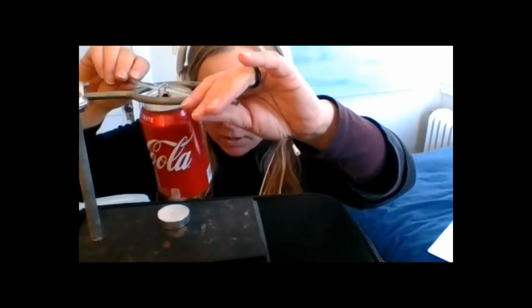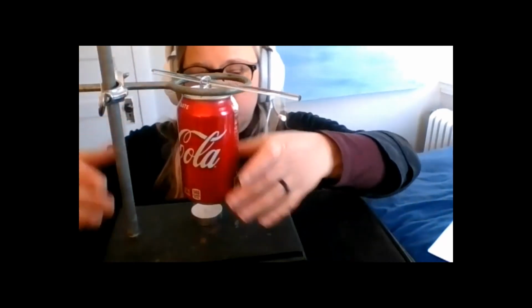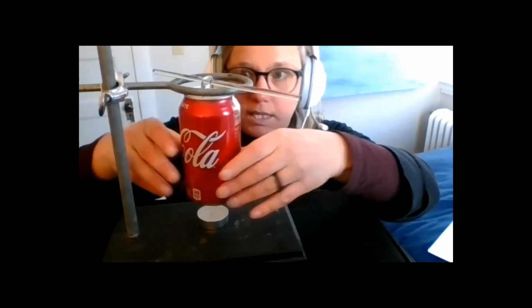Okay, so now that we've got all of the theory and the calculations out of the way, let's show how in the world we do this experiment. You've got your ring stand, you've got your little pop can held up here. Hopefully you've already practiced how to move this around to lower or make it higher. You really want to try to get it just right before you put your water in and before you start heating, because it gets harder to move it around after it's been heating some.